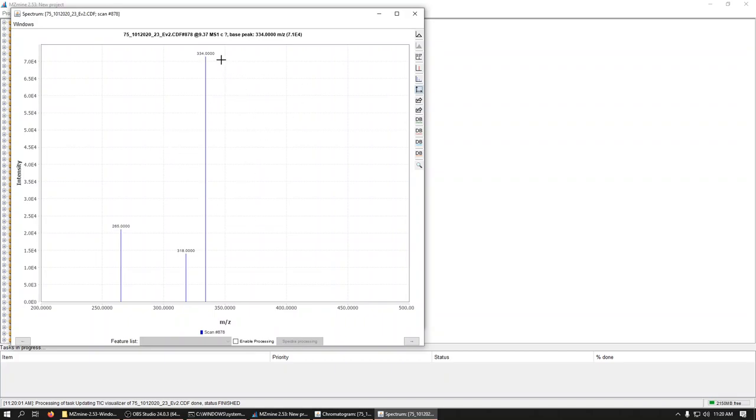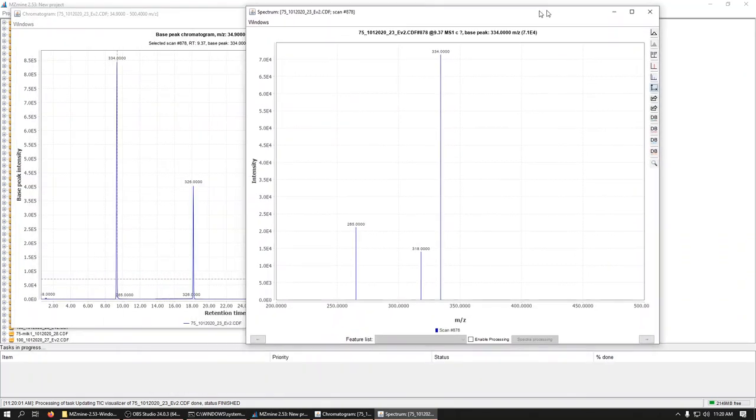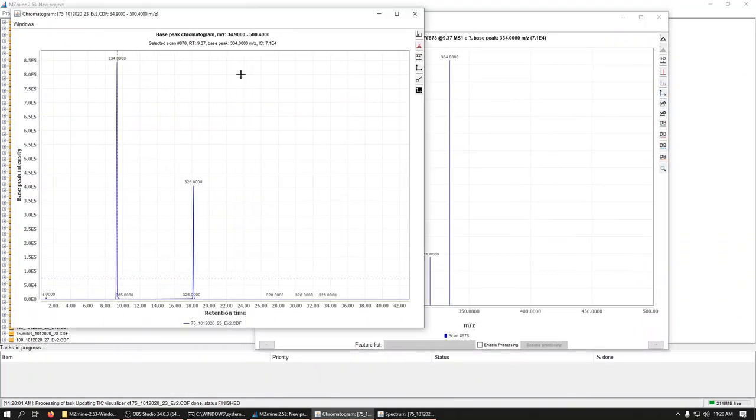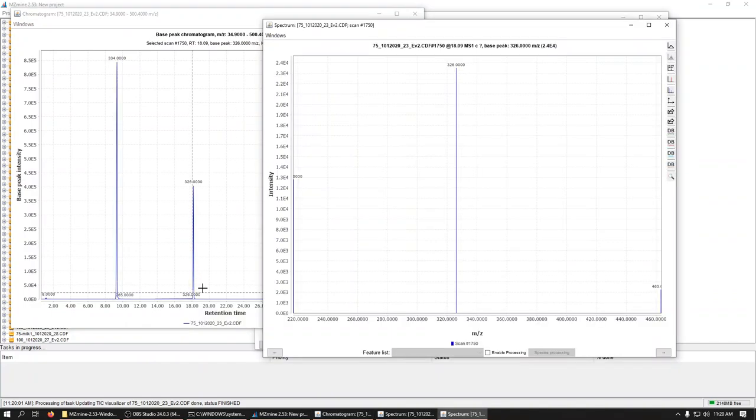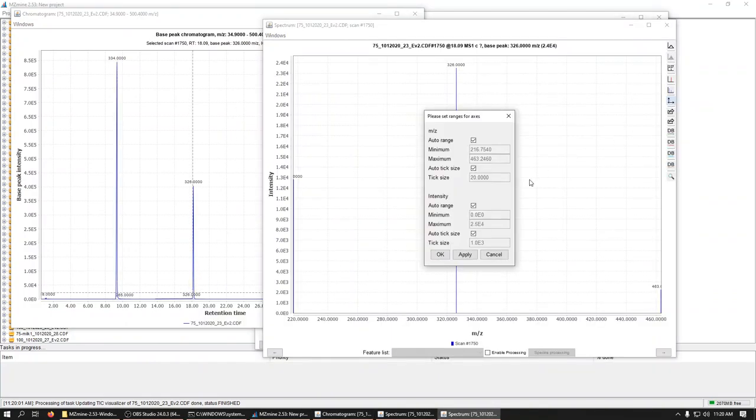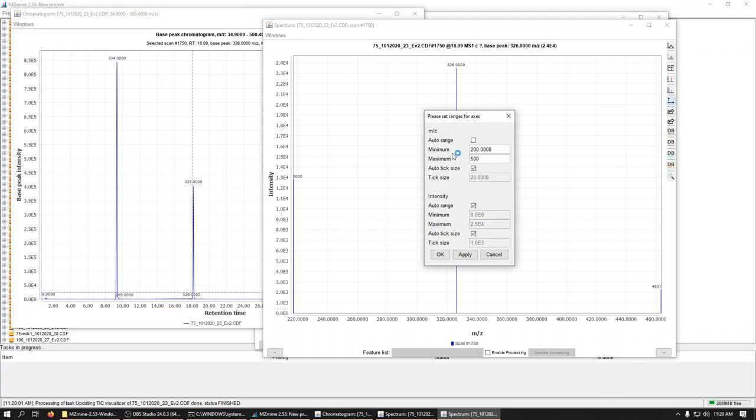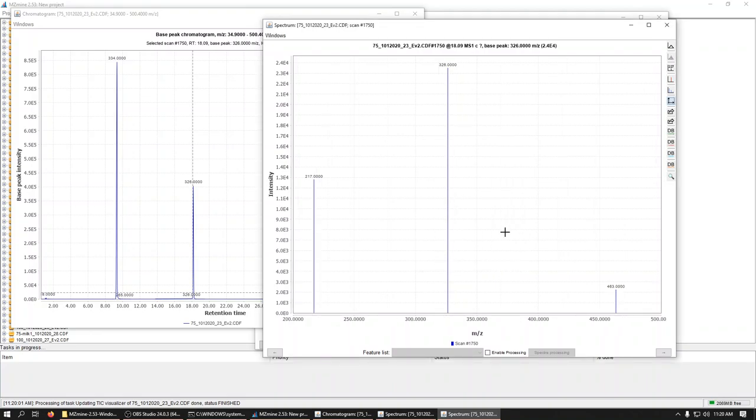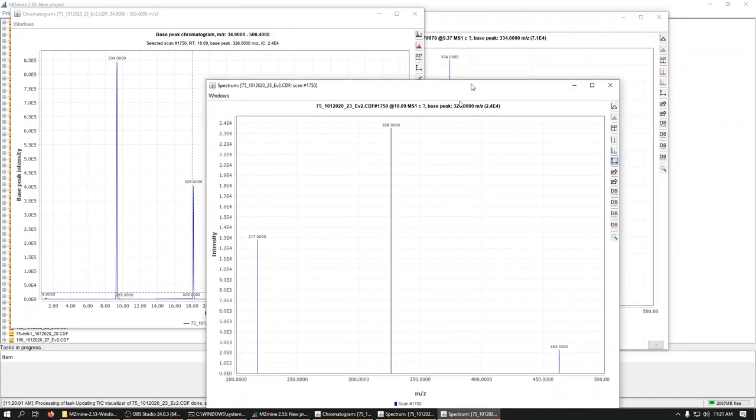There we go. So here, we were monitoring this one at 334, 318, and 265. And you can have as many windows really open as you want. So you can do the same thing and pull a scan here. Set this to the same range. And you can see our internal standard was measured at 217, 362, and 463.